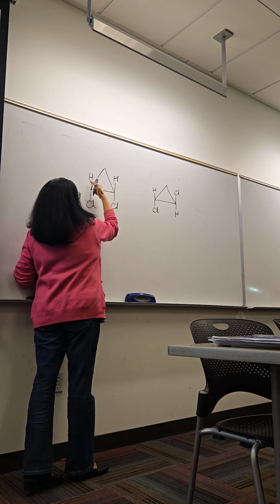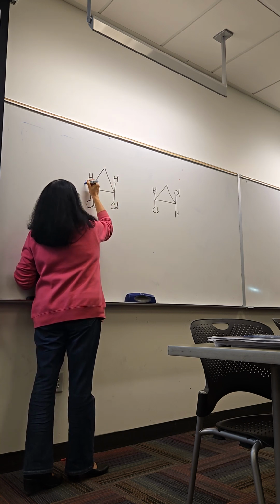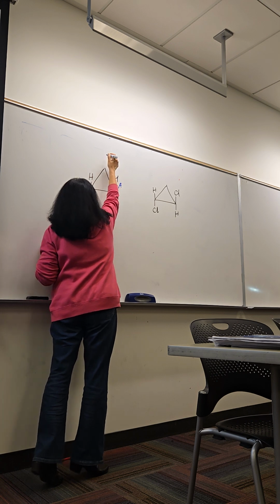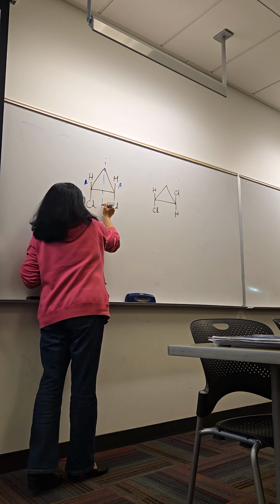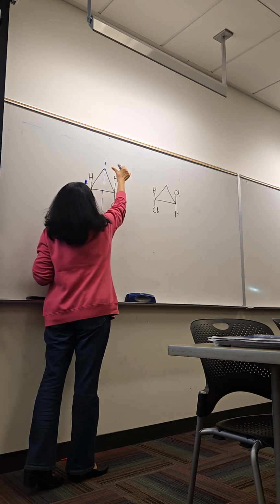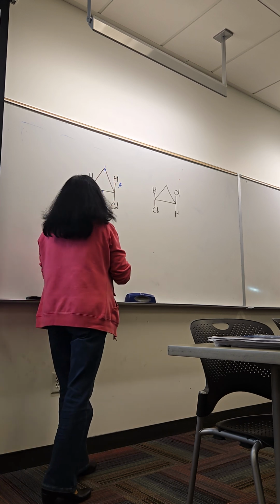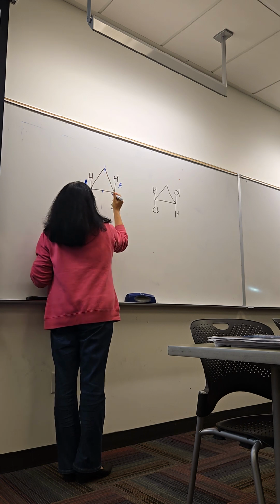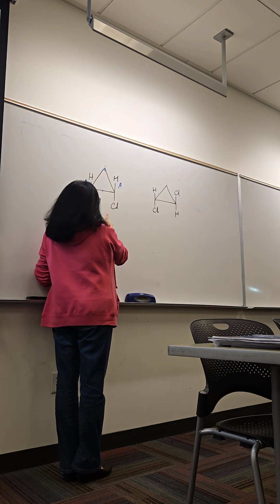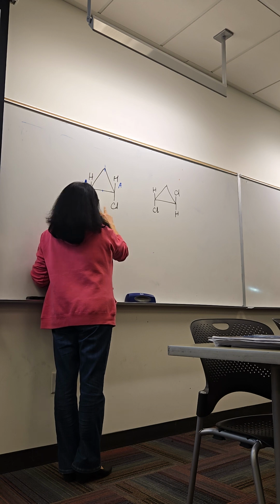So what can you say about these 2? Are they equivalent or not equivalent? Equivalent. You all agree? Yes, as you said, there is a plane of symmetry right there. I can cut it into 2 identical halves where this is equal to that. Absolutely right. Where are the other 2 then? The chlorines and the one above. Say again? The chlorines are on the bottom.